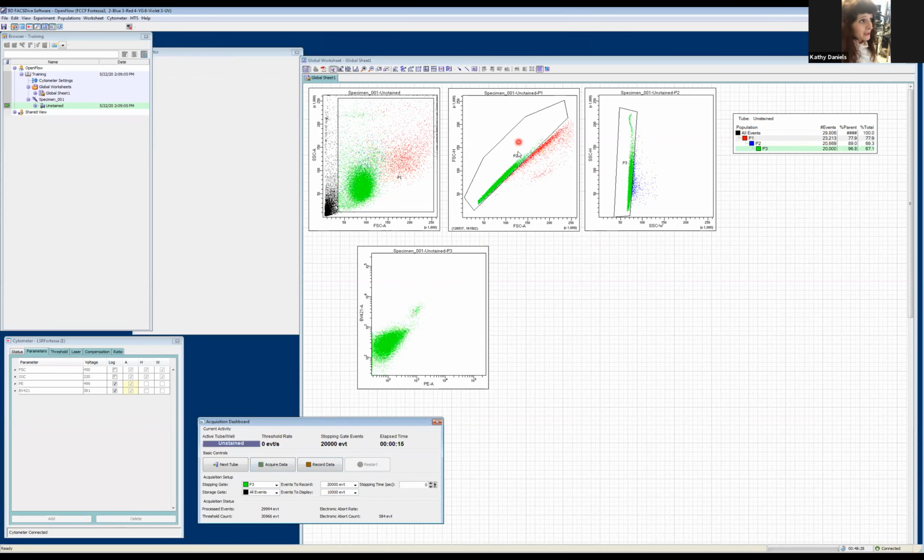It has to meet all three criteria because it's parental gating, and you're going to essentially look like you have 100% single cells. So I typically advise against that unless you're very sure of the application and what you're using it for, such as rare cells, and maybe you have some red blood cells still in your prep or something like that, but it's not something that's typically suggested.